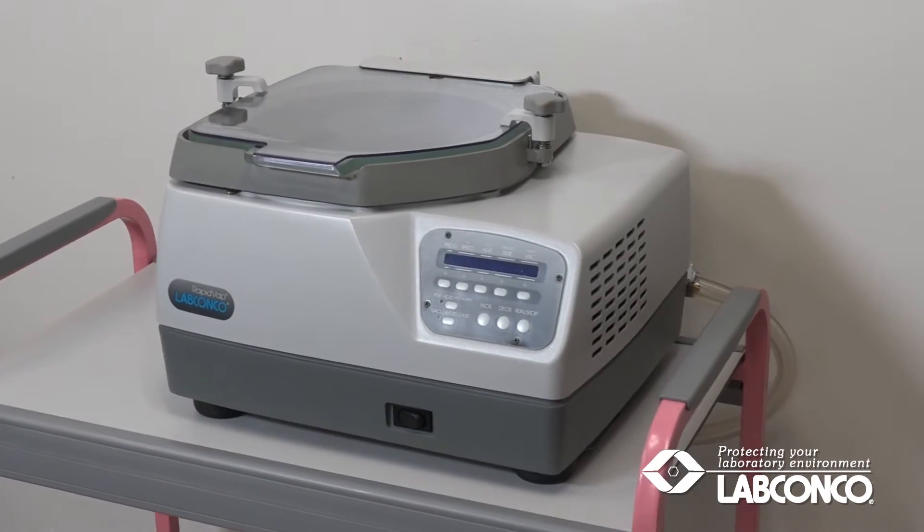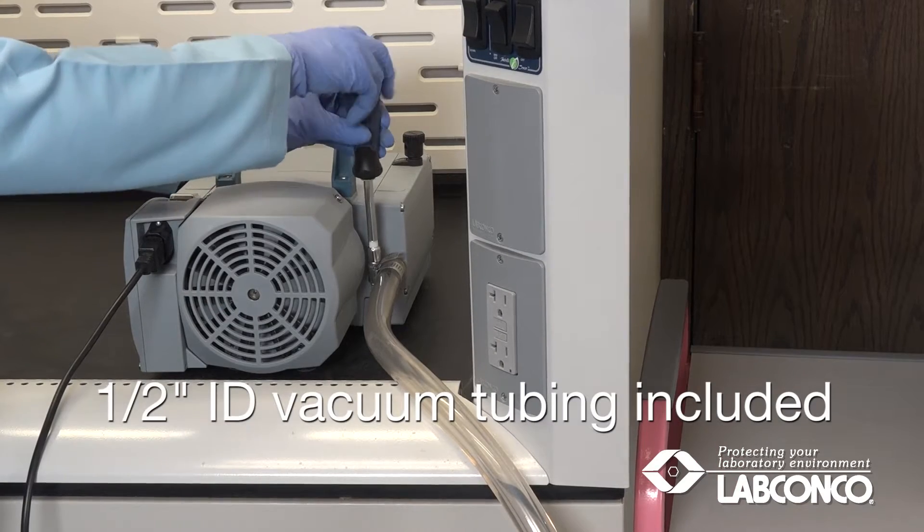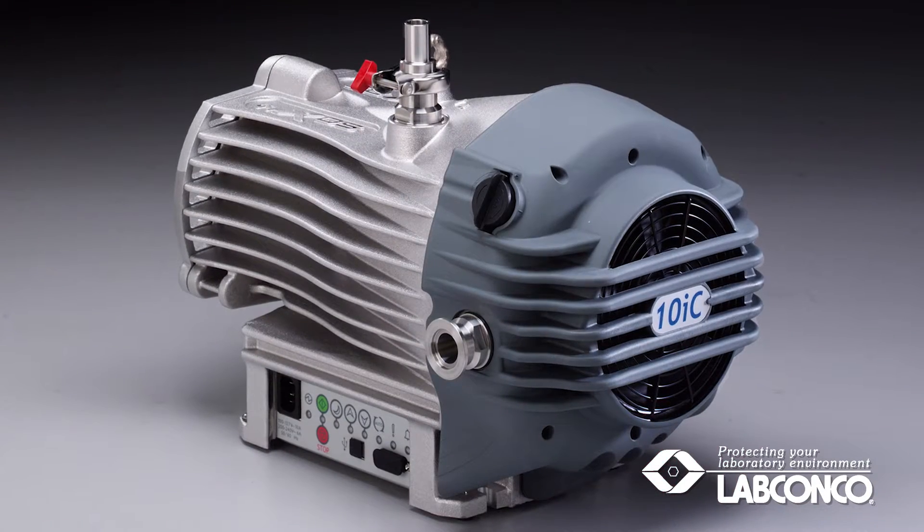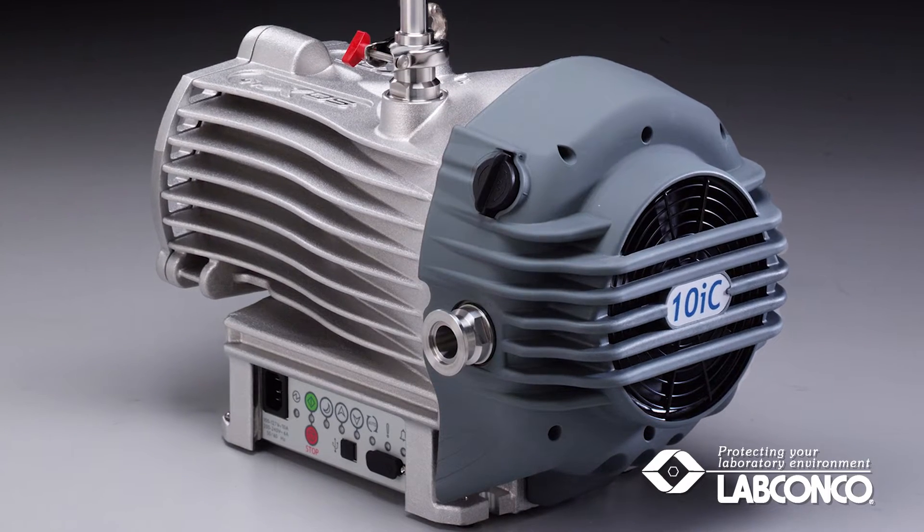Once the RapidVap is in place, connect the vacuum pump. A diaphragm or scroll pump is recommended capable of free airflow of 88 liters per minute at 31 millibars.